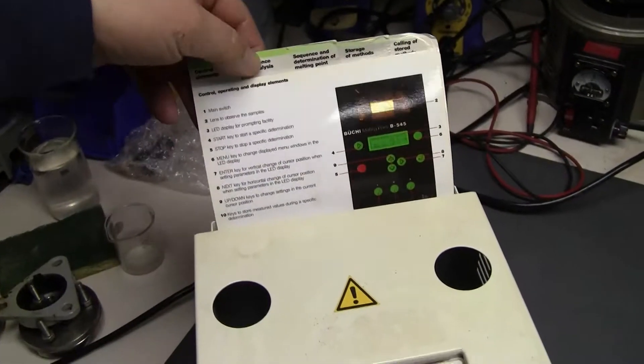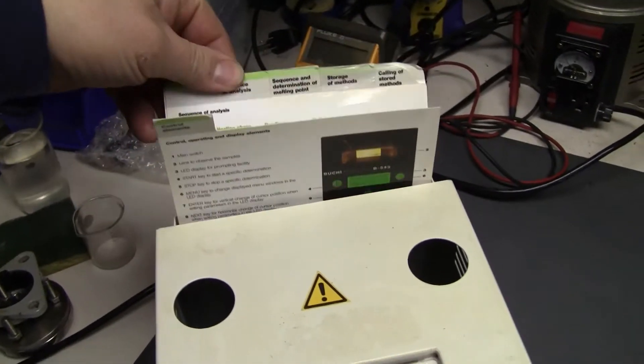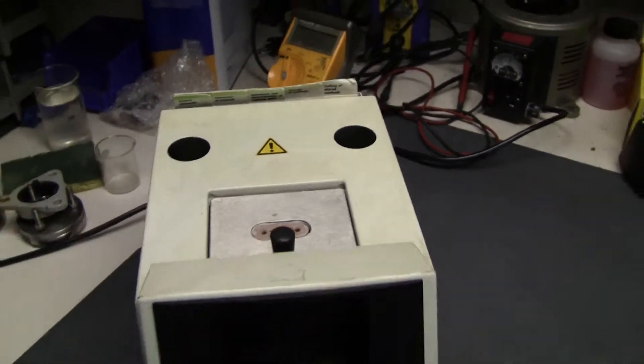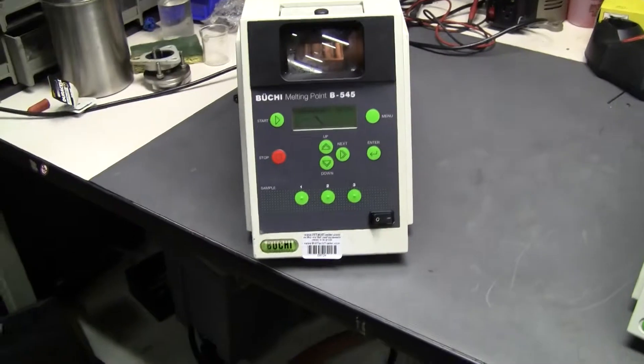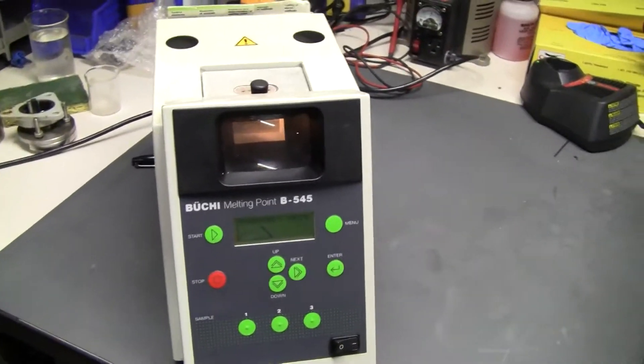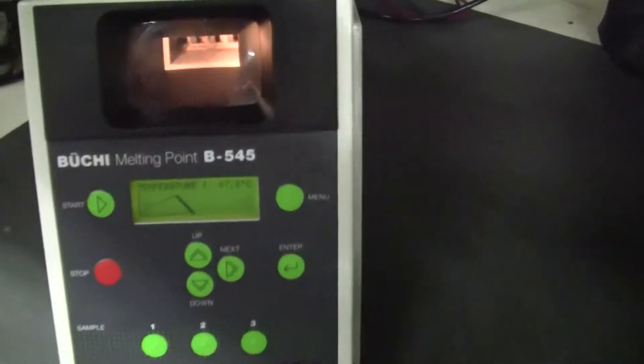It runs on 115 volts. The tab menus in the back are quite convenient, so you can just better see the display.